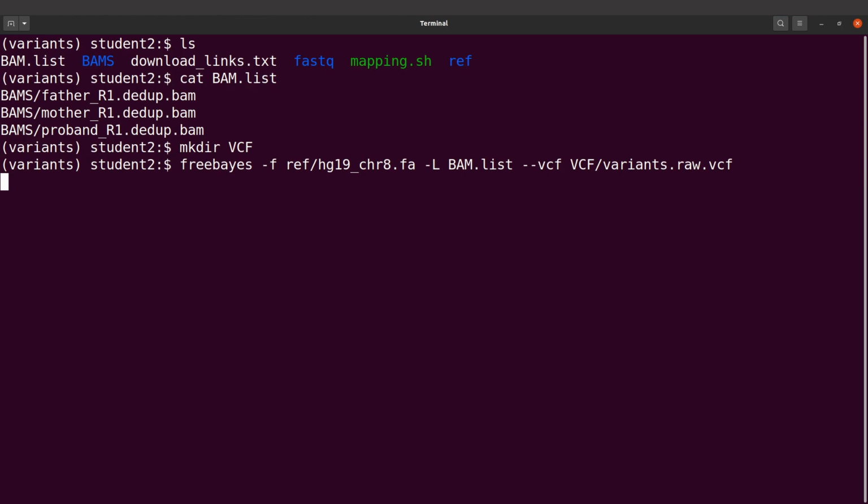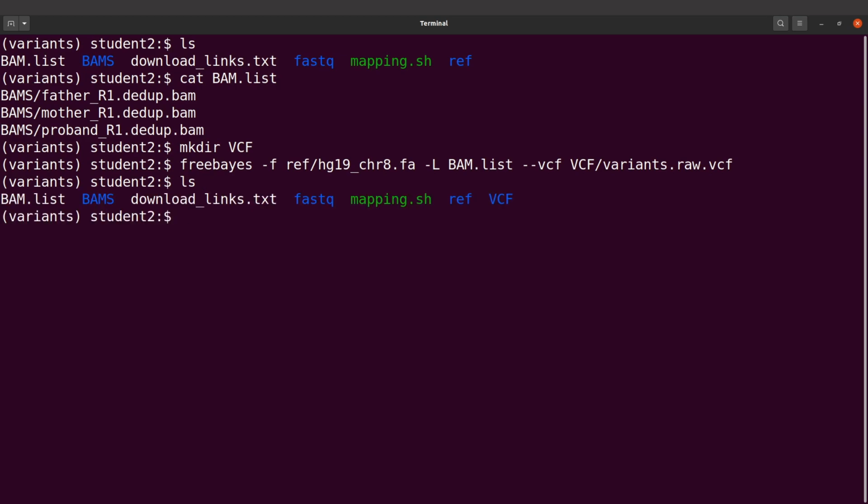All right. So Freebayes is working now. It will take some time, so be patient and wait for everything to get done for you. All right. Freebayes has completed its work. So if I do an ls, I'll find my vcf directory. I can ls into it to see my vcf file.